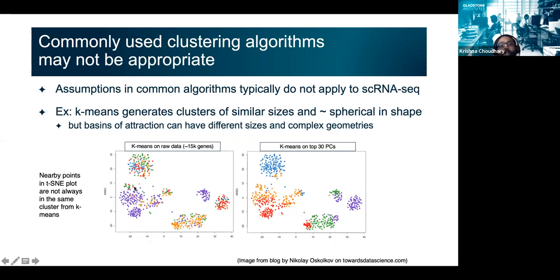But if you give it complex structure of data, then it will still be identifying balls. Clusters will look more like balls in whatever space you give it.